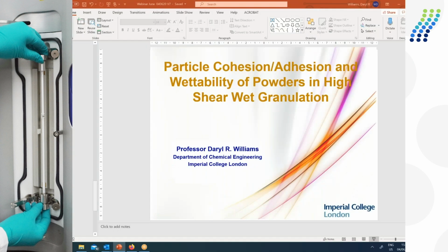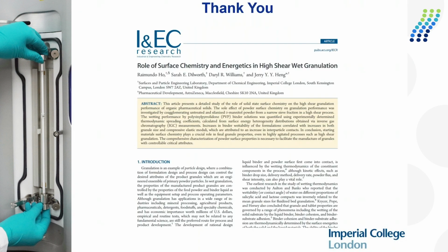The first one is: is it possible to measure the alkaline and acid components of surface energy, i.e. a 3-component method? So you can measure more components. My experience is I'm not sure it's going to add a lot of value. The reality is the theories for measuring more components are there. I don't know whether they often add a lot of value scientifically. You can do them, and we could have done them, although we didn't do that. I hope that answers your question.